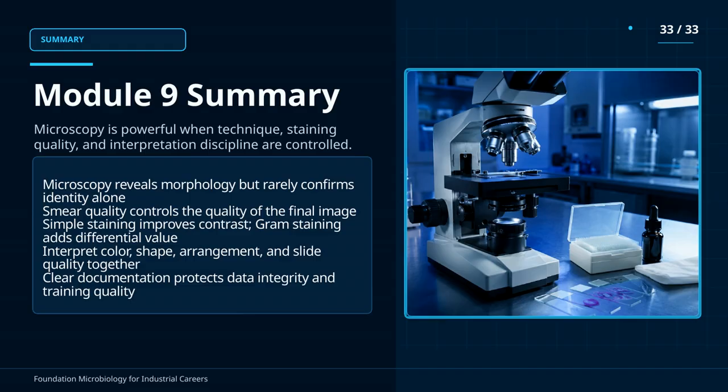Microscopy is most powerful when good technique, effective staining, and careful interpretation work together. Remember that smear quality controls image quality, and that clear documentation protects both data integrity and training quality.